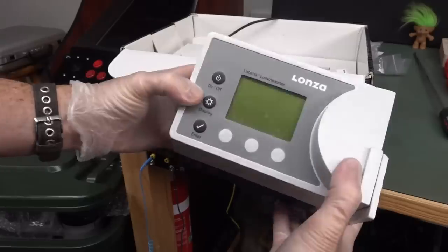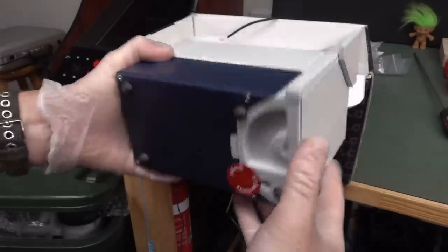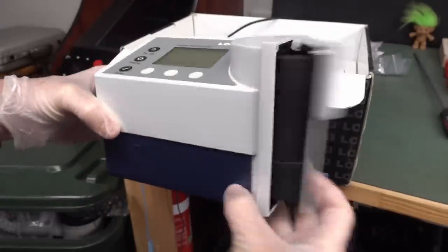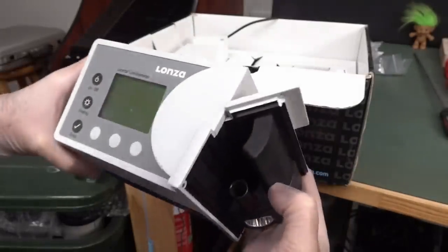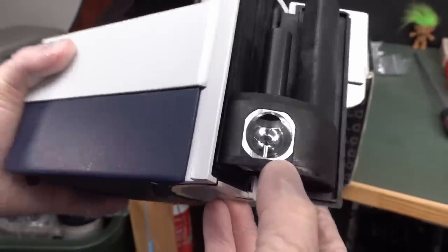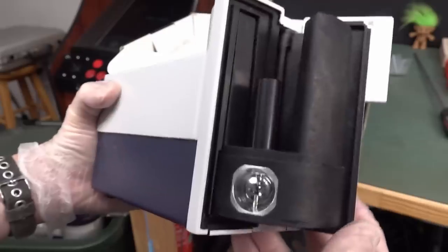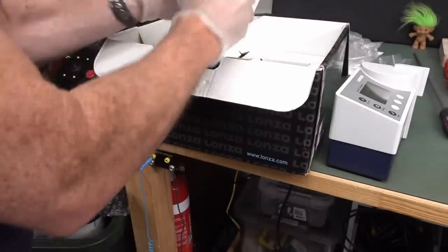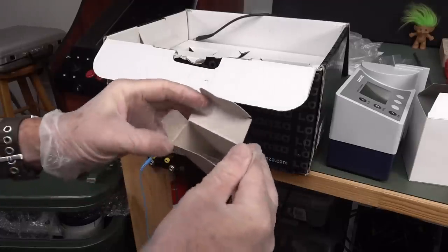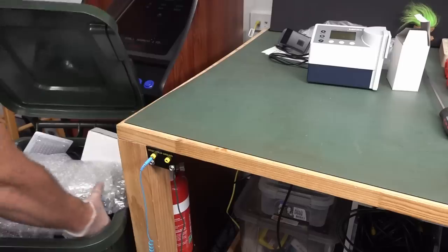Look at that. Lonza, a Lucetta Luminometer. It's still got the thing on it that, whoa, there you go. Look at that. That's where you obviously stick your sample in there. Don't know what that is. It's some weird reflective thing, you put something in there and then you close it up. I've got no idea. It's just a USB interface. So there you go, that's interesting. You put the tubes in there. They look completely unused, so you put your tissue sample or something, I don't know, a blood sample, in. More tubey bits.